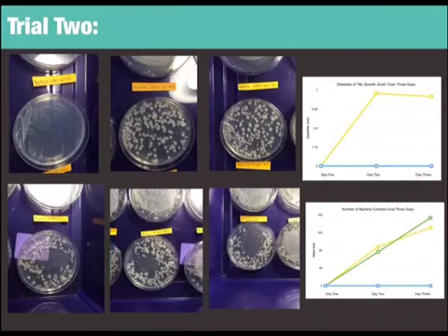During trial 2, there seemed to be a different type of bacteria growing in the dishes because there were little white fuzzy circles instead of the gel-like substance in the first trial. Nevertheless, the benign bacteria was able to produce a no-growth ring in this particular colony of bacteria, which is shown by the areas around the saliva where no bacteria is growing. The graphs also portrayed that the dishes without spit had the most colonies and no no-growth zones.